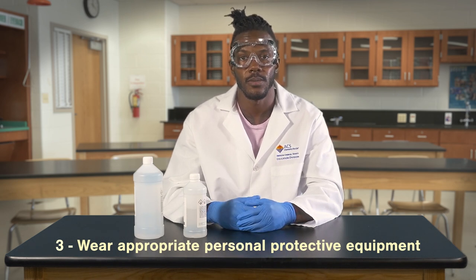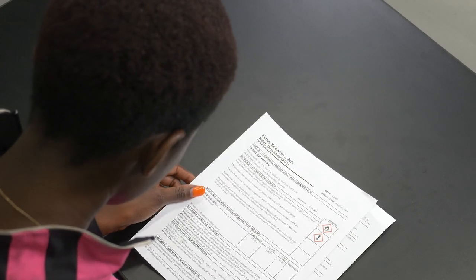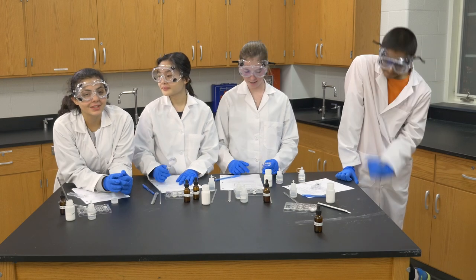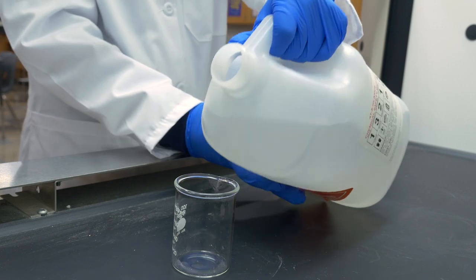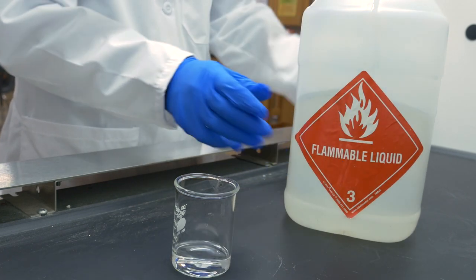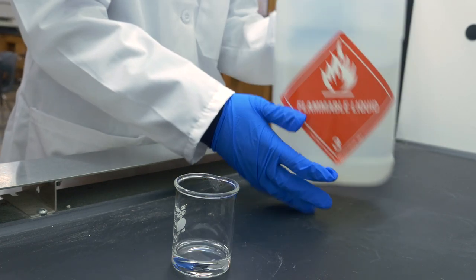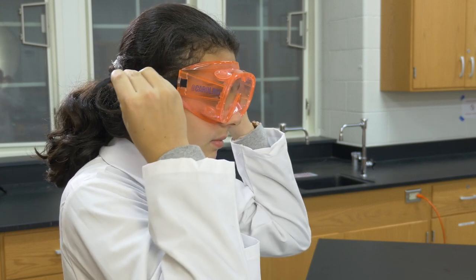Here are a few other practical tips to help you minimize risks and prevent accidents in the lab. Carefully study the written procedure along with relevant safety instructions before coming to lab. Ask questions if you don't understand something or feel you need more information. Work with volatile chemicals in the fume hood. This is a special ventilation enclosure that removes chemical vapors and thus prevents exposure to chemicals that may be harmful if you breathe them. Wear chemical splash goggles whenever working with chemicals, heat, or glassware.